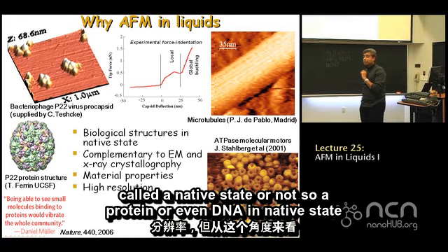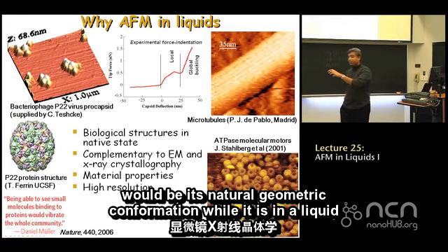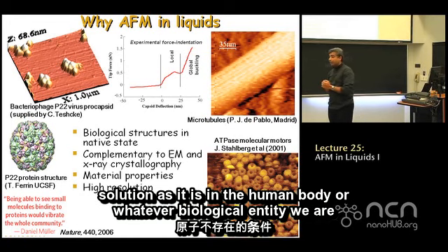So a protein or even DNA in native state would be its natural geometric conformation while it is in a liquid solution, as it is in the human body, or whatever biological entity we're talking about.